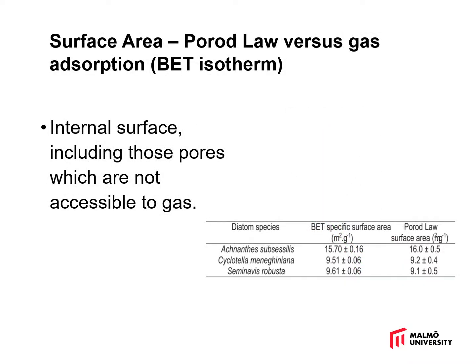And we may use this limiting intensity to estimate the surface area per unit volume of the sample. And so what I've given there in the table are surface areas estimated from the Porod region and surface areas which have been measured directly from the BET adsorption isotherm for nitrogen. The numbers agree quite well.